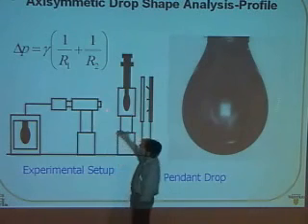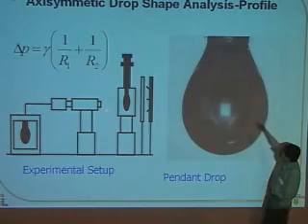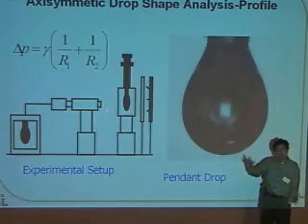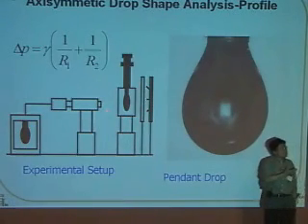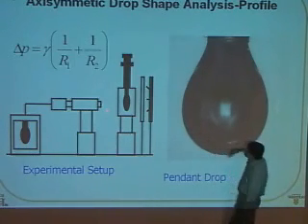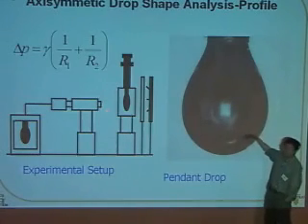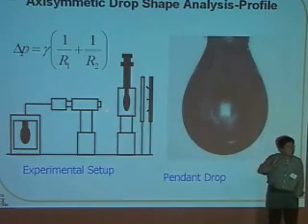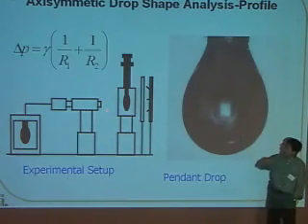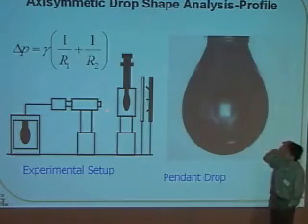You may ask me how this is related to biomedical research. Well, we can use this to study the so-called lung surfactants. A lot of newborns can't breathe by themselves because of the lack of lung surfactants. If the lung surfactant adsorbs to the surface, say the air-liquid interface, then the surface tension is reduced so that you can breathe easily. So you can use this to quantify lung surfactant behavior and find a therapy. This is the application.